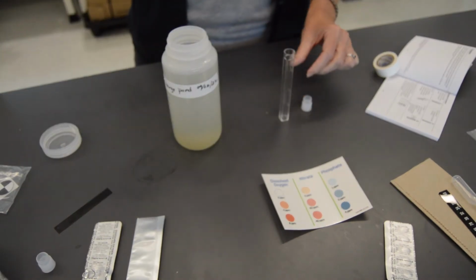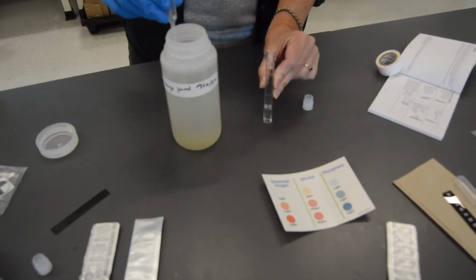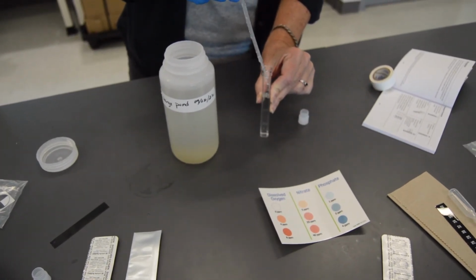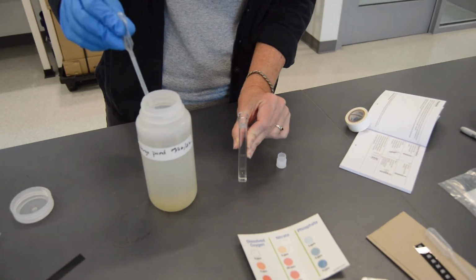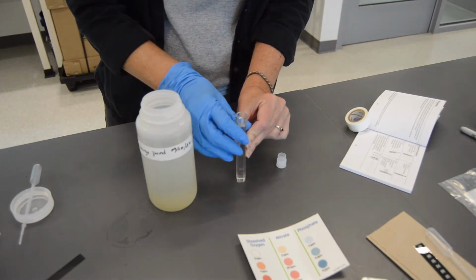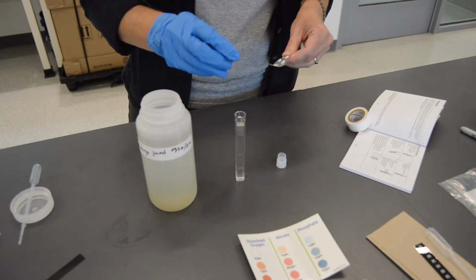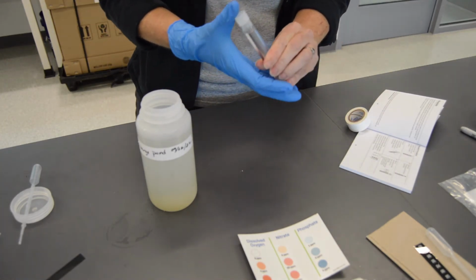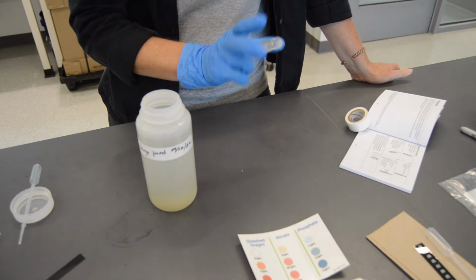Okay, so now we're going to test for phosphates. So for the phosphate test, using this kit, we want 10 milliliters of water. Fill up all the way to our 10 milliliter line. And we get our little phosphate test tablet. Cap it, and then we're going to invert until the tablet dissolves. And then again, we have to wait for the color to develop. So once the tablet dissolves, we wait for about 5 minutes to get a color development.